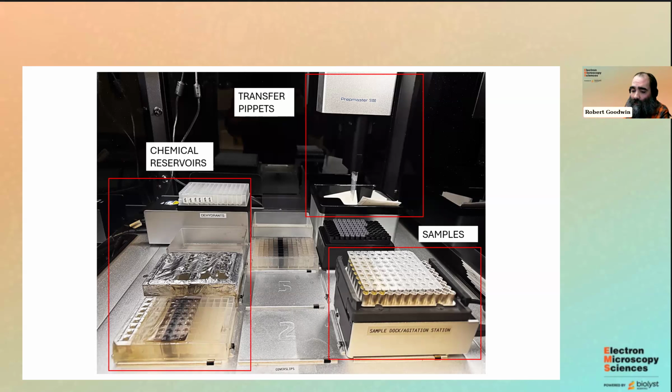If I have something that's not elongated, like a cylindrical shape like my renal biopsies, and I still need it in a certain orientation, I'm going to cut and prepare that sample so that afterward, it's just as if you were processing in a 5 mil tube or something like that. I'm going to cut it in a way that I can tell orientation. We've done rat corneas, just the cornea, the outer portion of the eye, which was a little bit challenging. It processed well in here, and then I just cut those into a shape that makes it easier for me to identify which way it needs to be oriented.